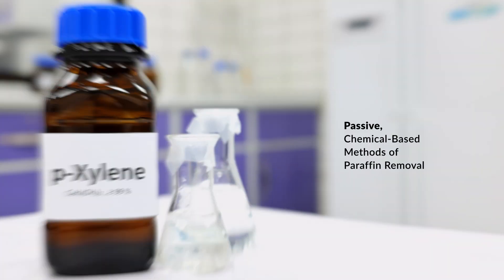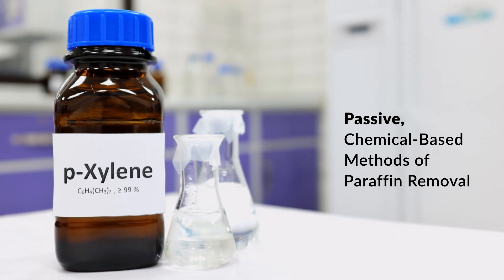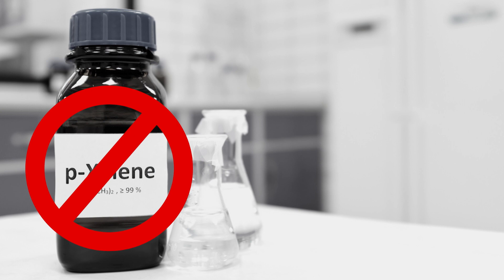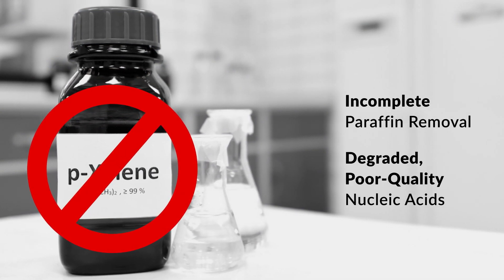Passive, chemical-based methods of paraffin removal can be challenging and labor-intensive, often resulting in incomplete paraffin removal and degraded, poor-quality nucleic acids.